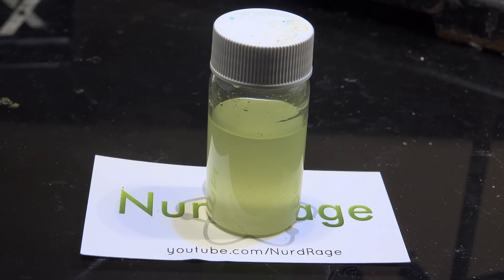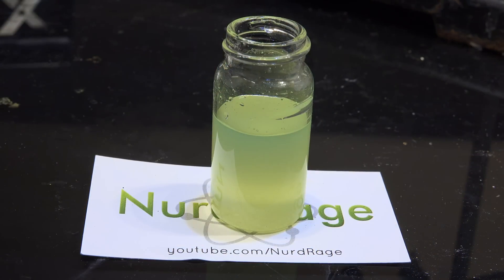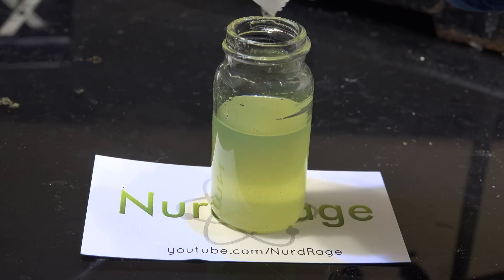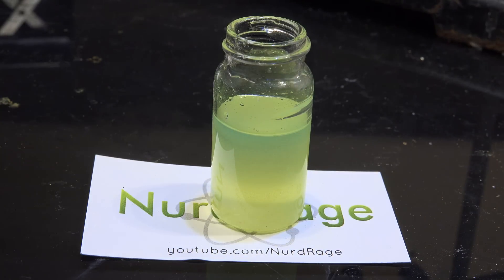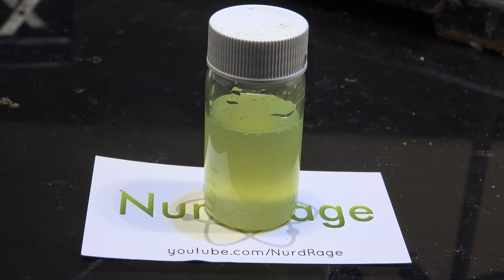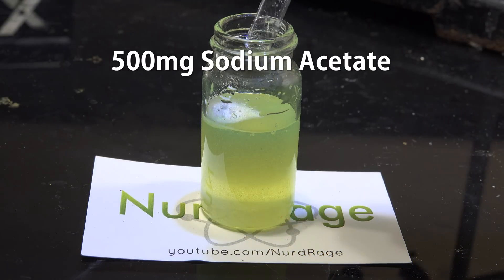If it is more reactive than hydrogen peroxide then maybe it won't need a base. Now that it's all mixed up, we add the resin hardener containing our organic methyl ethyl ketone peroxide. I'm adding in a few drops. Nothing seems to be happening yet — let me shake it up. Okay, doesn't seem like anything is happening. Let's add in the sodium acetate base now, since that's generally needed when working with a weak chemiluminescent substrate like TCPO.